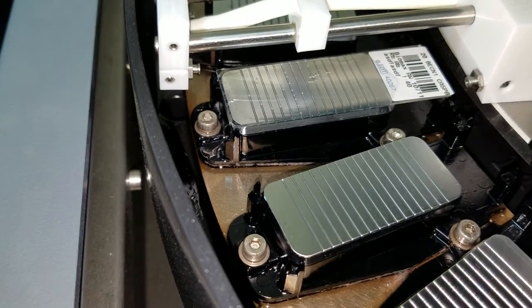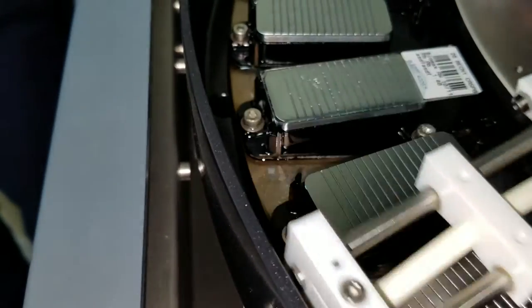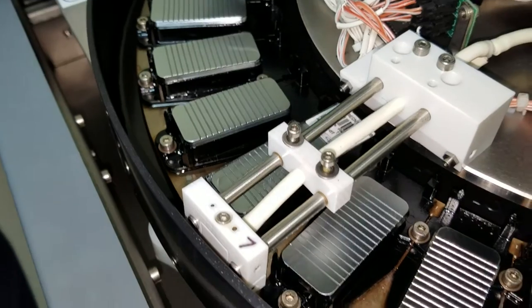That's why it always takes forever — it's just spinning. It seems like it's doing nothing, but it's actually mixing. So that's the last mixer there.